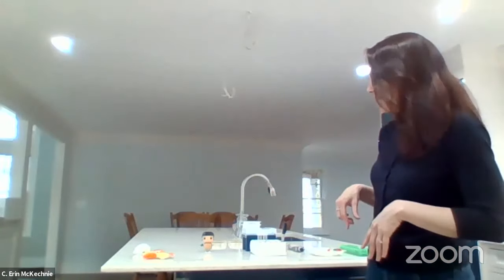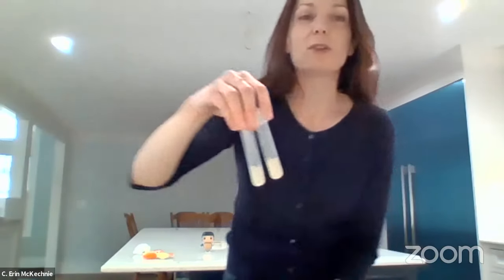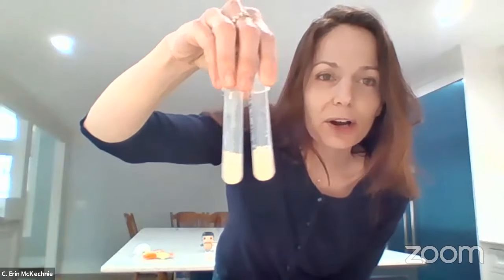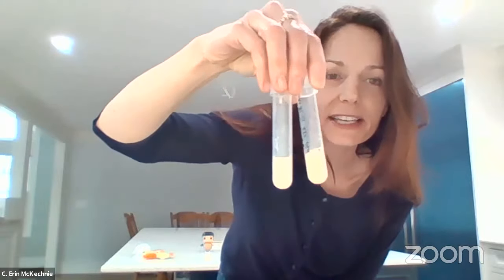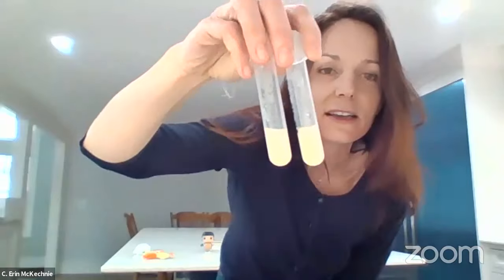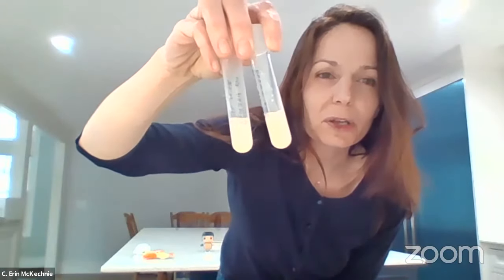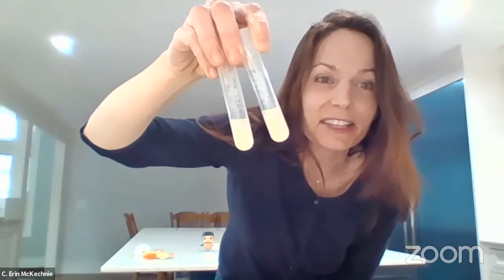So right behind me, I have some bacteria, which I grew in tubes. I actually grew these at the lab, and these are two different types of bacteria. Now, I know that the camera's not perfect, but if you're looking at this, do they look the same or do they look different to you if you were just looking at their outward characteristics? To me, they look the same.